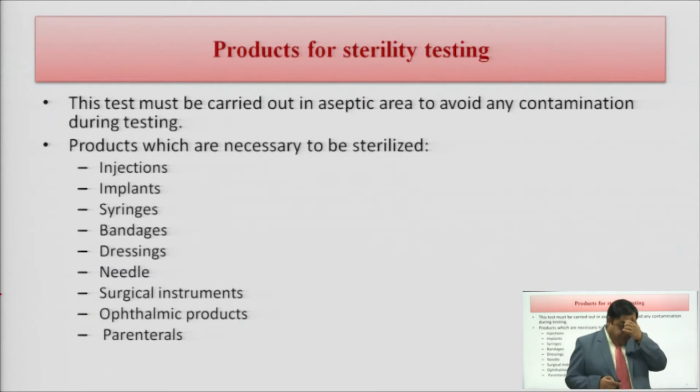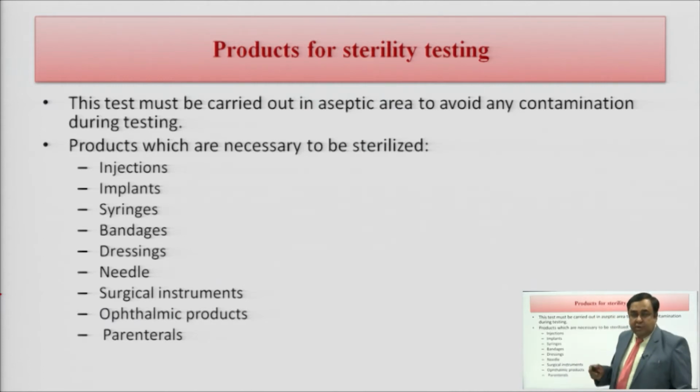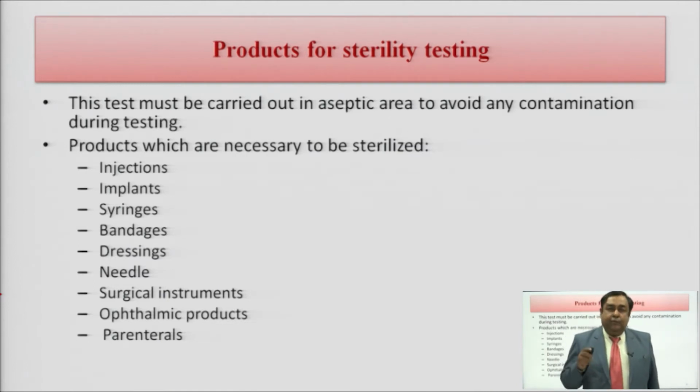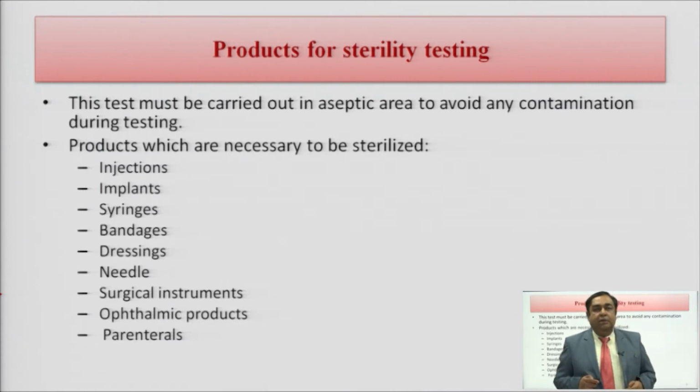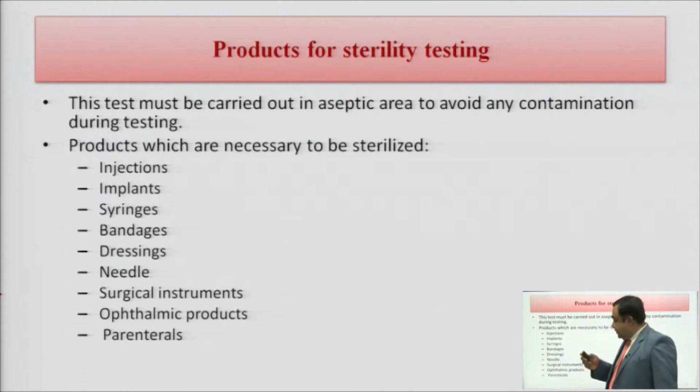The only precaution which you need to take during this test is that the test mandatorily needs to be carried out in an aseptic environment, so that there is no contamination during the testing procedure. That is, whenever you are doing the test, you have to be very sure that the media and the area where you are carrying out the test have no presence of bacteria. That is, the environment is aseptic. So, this test must be carried out in an aseptic area to avoid any contamination during testing.